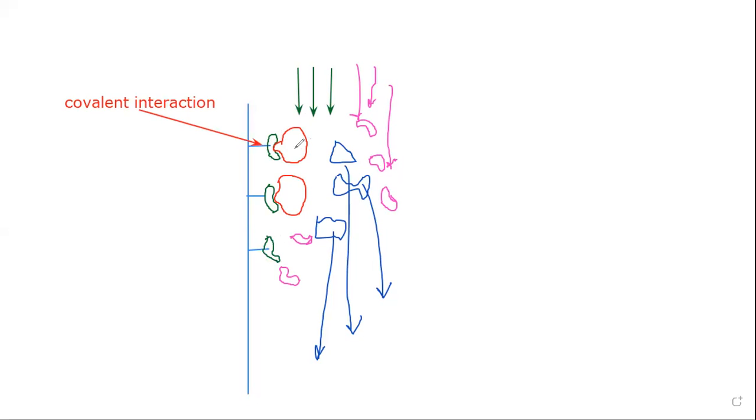Okay, so the red colored molecule can come out of this place here, position number 1. Let me also put that here. Position number 1. Okay, here it is position number 2. This probably is position number 3. So this molecule from position number 1 can get removed from there and it can bind to position number 3. A molecule from position number 2 can go to position number 3 or 4 or 5.